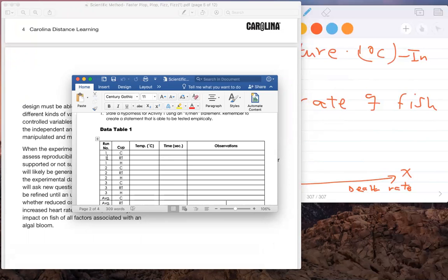And then I'll drop it at the same time, start the stopwatch, and record the time it takes, and read the observation. You can do one at a time. If you are by yourself, I recommend you do this by itself. How long does it take? Room temperature, write the observation. It might be the same, that's fine.